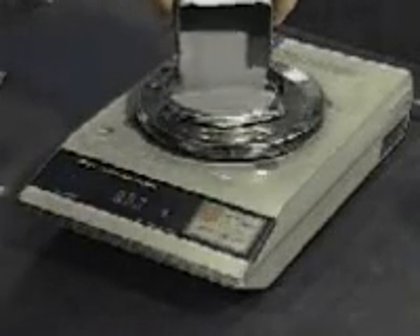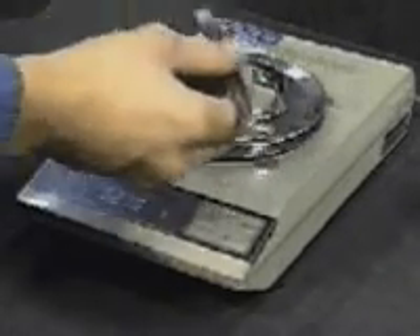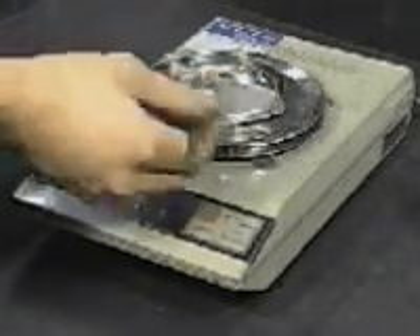The test specimen shall consist of a mass of 50 plus or minus 0.1 grams of metal powder obtained in accordance with MPIF Standard 01, sampling finished lots of metal powders.